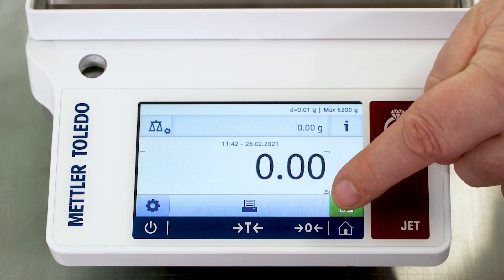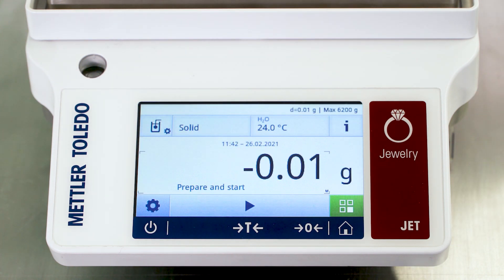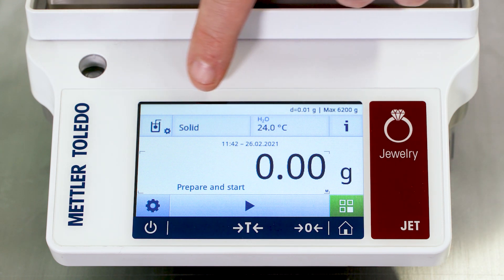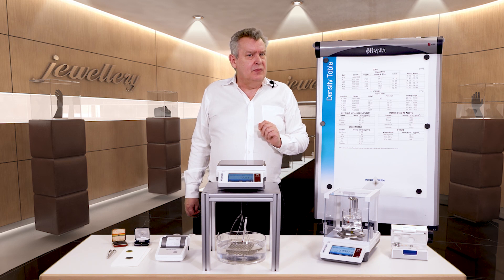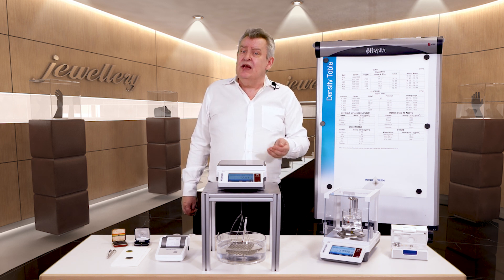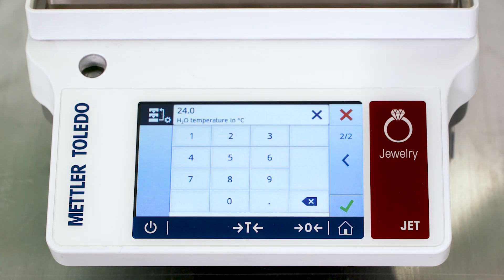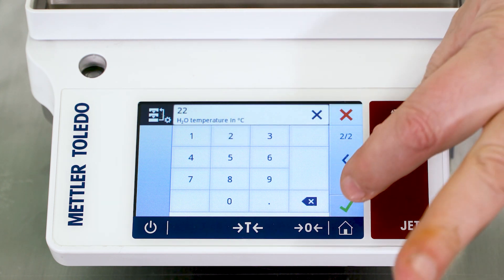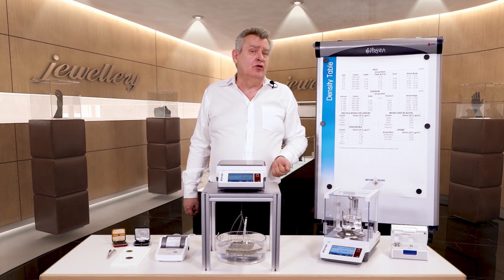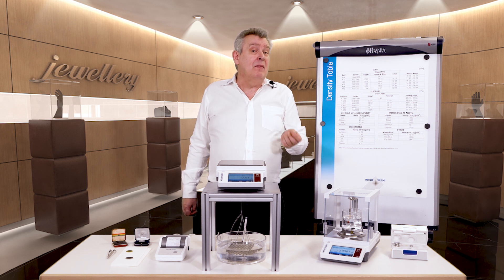We press on the green screen applications and scroll through to the density app. We arrive at the start screen — the color touch screen is menu guided, so we just press start and follow the on-screen instructions. Before starting, we need to enter the temperature of the auxiliary liquid and confirm what type of liquid we're using. For jewelry samples we recommend deionized water, but you could also use ethanol. We simply tap on the touch screen to confirm our selection, and now we're ready to measure the purity of our sample.